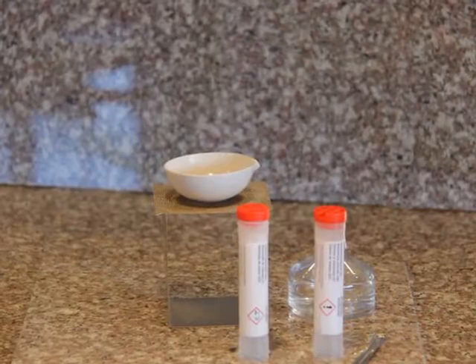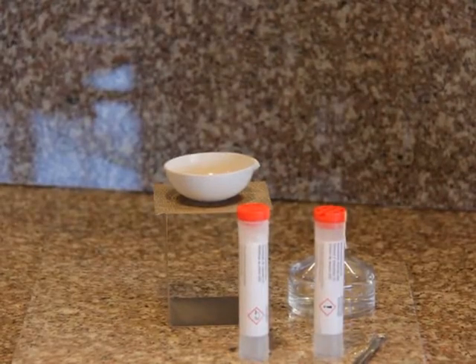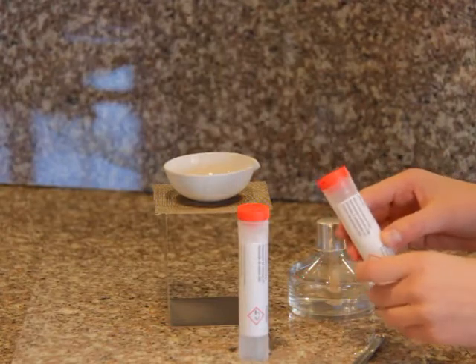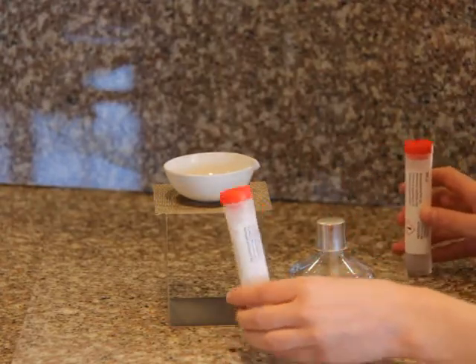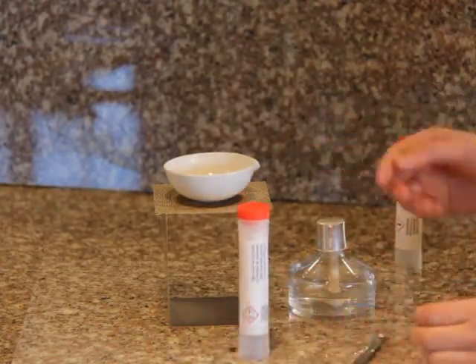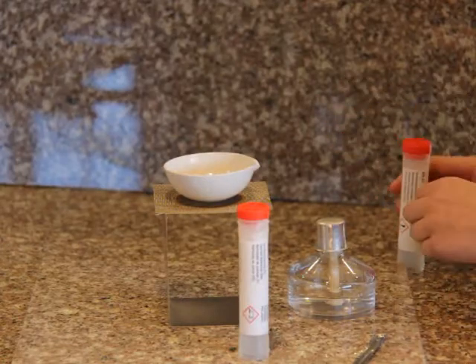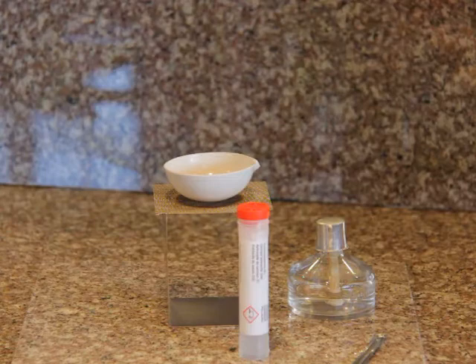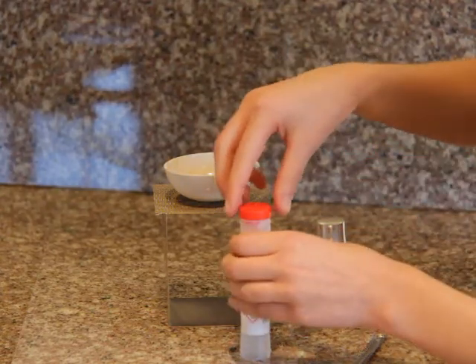Today I will be doing experiment number eight. To do experiment number eight, I need to heat one spoonful of ammonium chloride and one spoonful of calcium hydroxide in the evaporating dish. I already have one spoonful of the ammonium chloride in there, so I just need to put the one spoonful of calcium hydroxide in there.